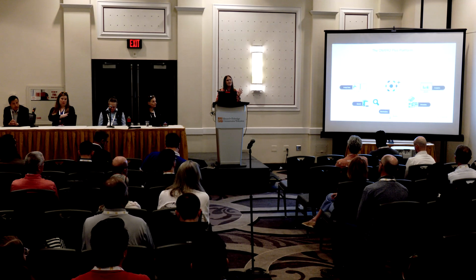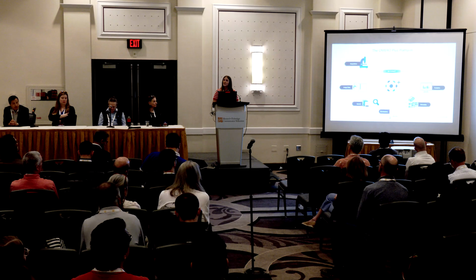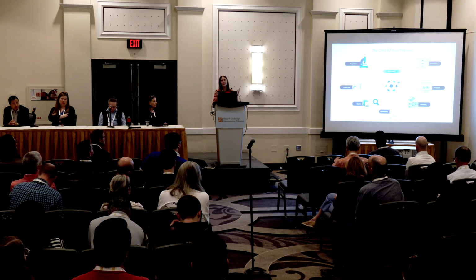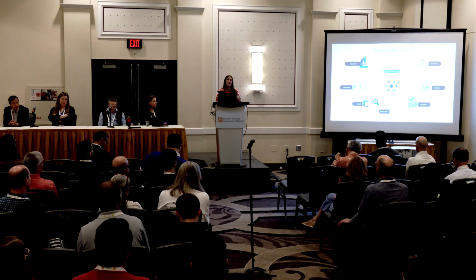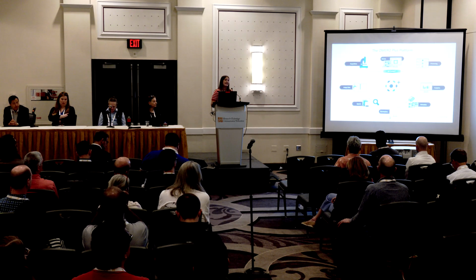And so all of this is running on a server somewhere in the context of Omero Plus, and you as the end user are interacting with this system over the internet or maybe some private network within your organization. You might be in the core facility acquiring new data and bringing it into the system. Or you might be doing some image processing. Maybe it's not you, a human, but a Python script, doing some interesting custom image segmentation, and you want to write that data back into Omero Plus, bringing in more metadata, more analytical data into the system. Or you might be exploring your images in any capacity.